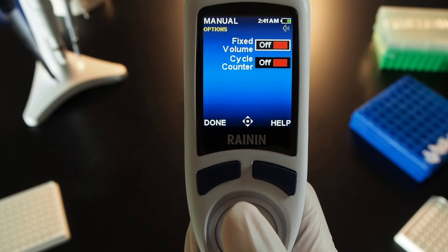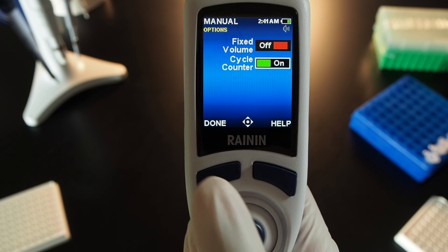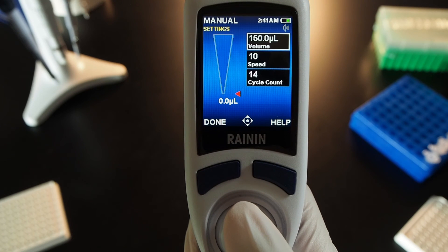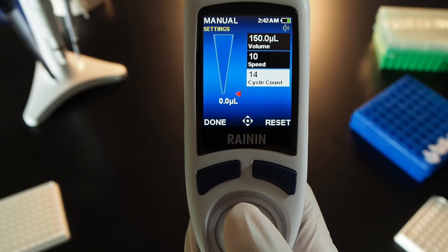To use the cycle counter, go to options, move the joystick down to the second option, and press the joystick in to turn the cycle counter on. Press done to exit and move the joystick right to go into settings. Adjust volume and speed settings as you wish, then move the joystick down to the cycle count box and press the joystick in to adjust the setting.